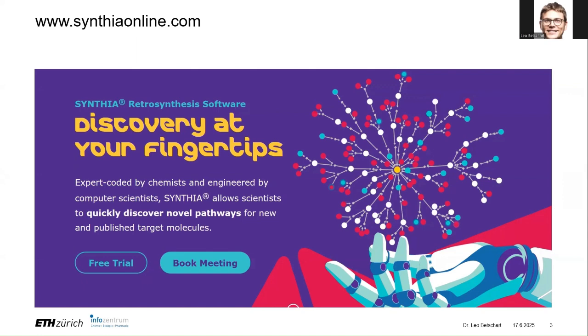We have just recently started licensing it, and by the time that you see this video online, you certainly will be able to register for the software and start using it. And you can see the information in the show notes below.